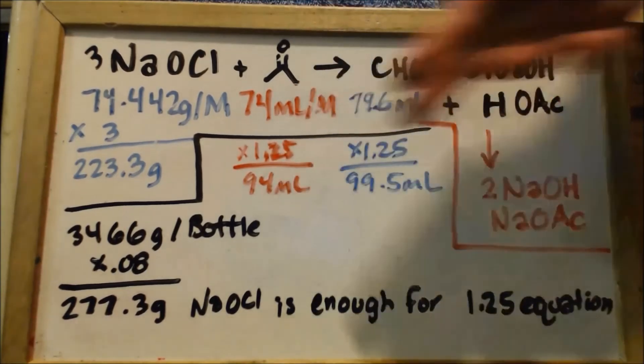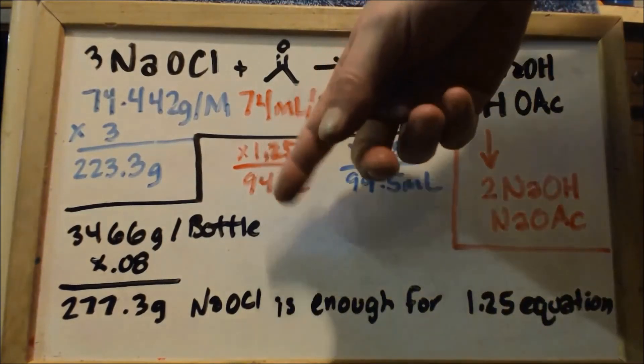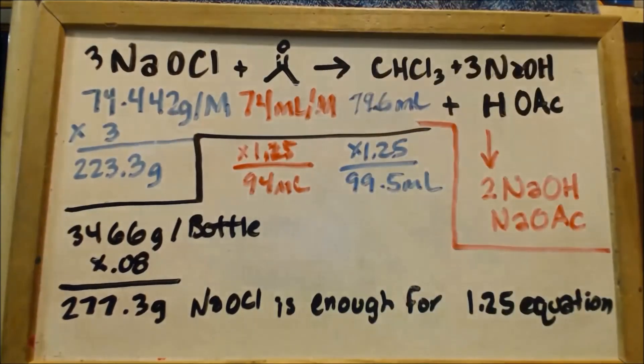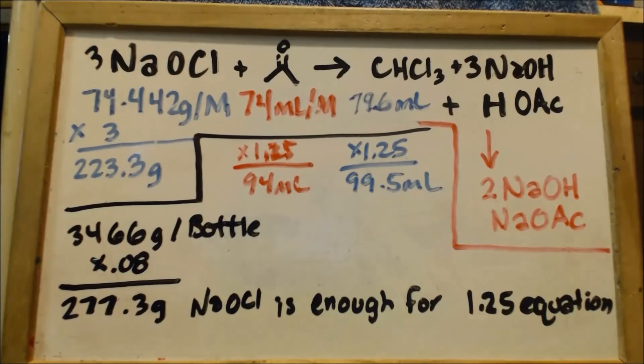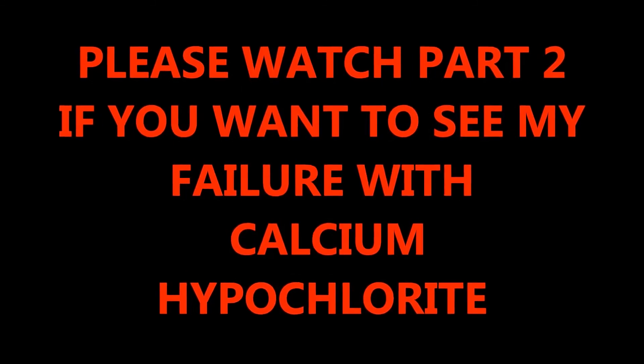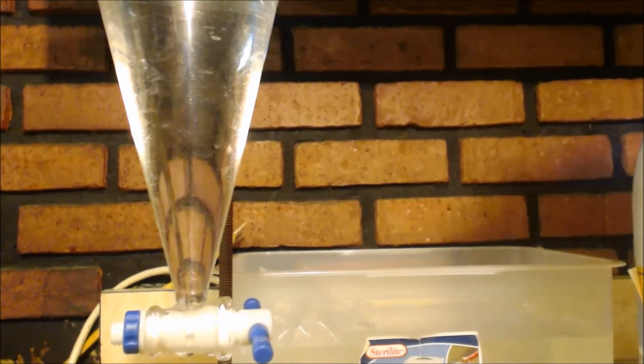I'm going to put in, actually I'm going to put in 90 milliliters. So I guess I should have taken my yield from that. But it's not going to make much of a difference. 94 and 90 milliliters. It's still going to be low, low yield. I always remember. It sounds just great. Alright. I can't take it. I can't take it.